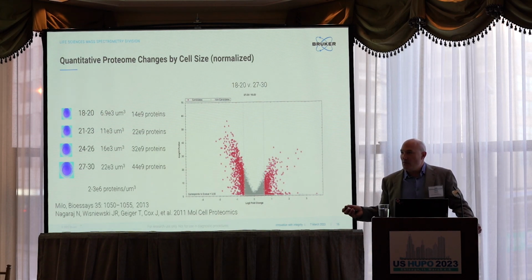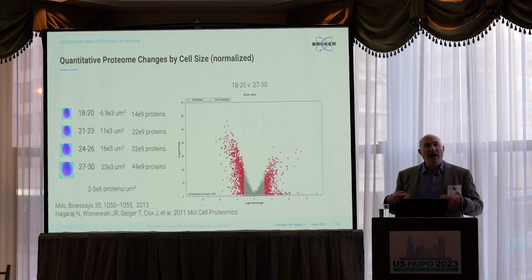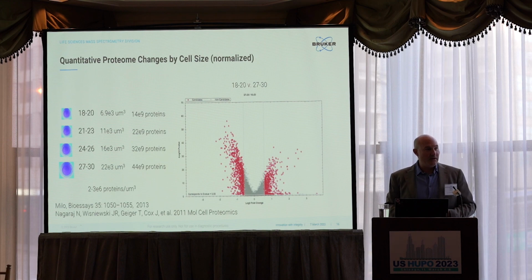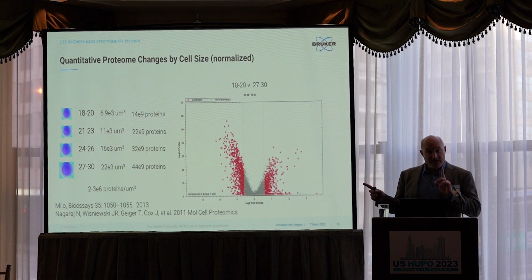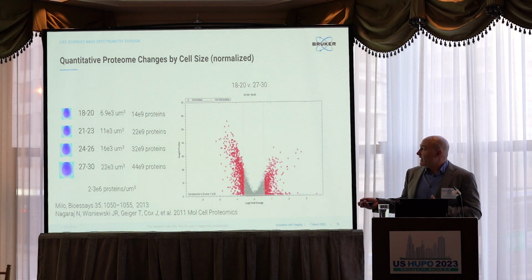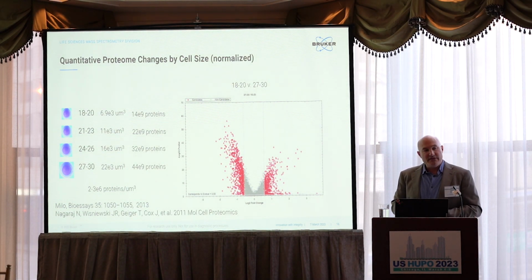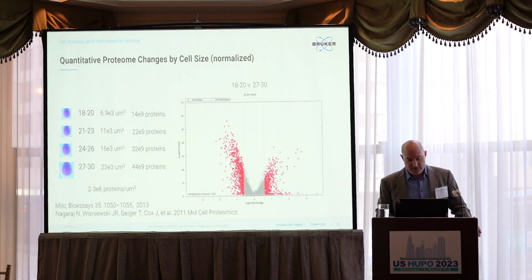So we were actually quite worried about this, to ask what this means in terms of how to normalize, right? Because you can expect very different expression profiles accordingly. And we've done these experiments, both normalized and unnormalized, and I'm happy to say that actually, even in the unnormalized data, we still see very good distribution of those.